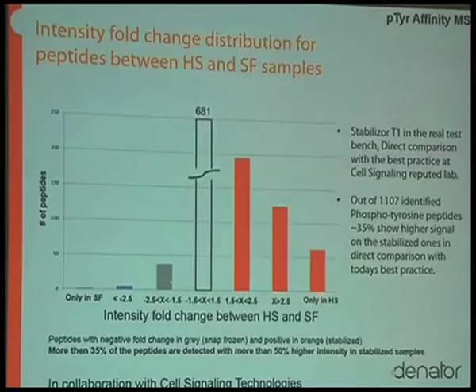And there's also a few that decrease. So in this case, they would have had a higher level of phosphorylations in the snap frozen samples. So these would have added phosphorylations during the extraction and postmortem. These would have lost phosphorylations during the extraction. So roughly 1/3 of the tyrosine phosphorylations that we detected in this study have changed at least 50% compared between these two experiments.